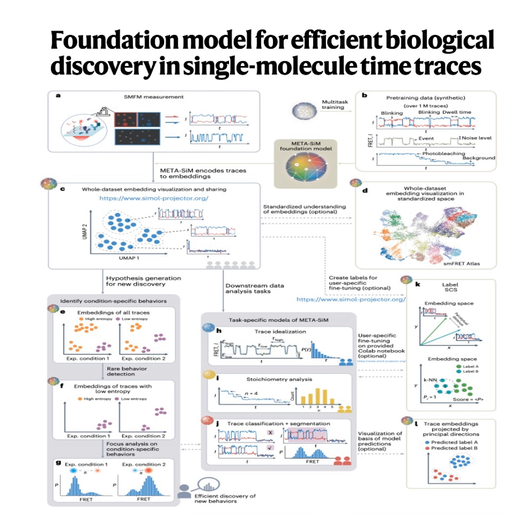Okay, so the LLM understands biology text, and META-SiM understands the SMFM data. What could you do with that combination? Imagine, instead of just seeing a cluster of low LSE points on the map and having to figure out what it means, you could ask the system directly, in plain English. Like, explain the potential mechanistic difference between the molecules in this main cluster and these rare low LSE molecules over here, considering these low LSE ones only appeared when I added drug X. And the system could, what, look at the dynamics encoded in the embeddings for both groups, correlate that with the experimental condition, drug X, and maybe query its knowledge base from the literature to suggest a hypothesis.